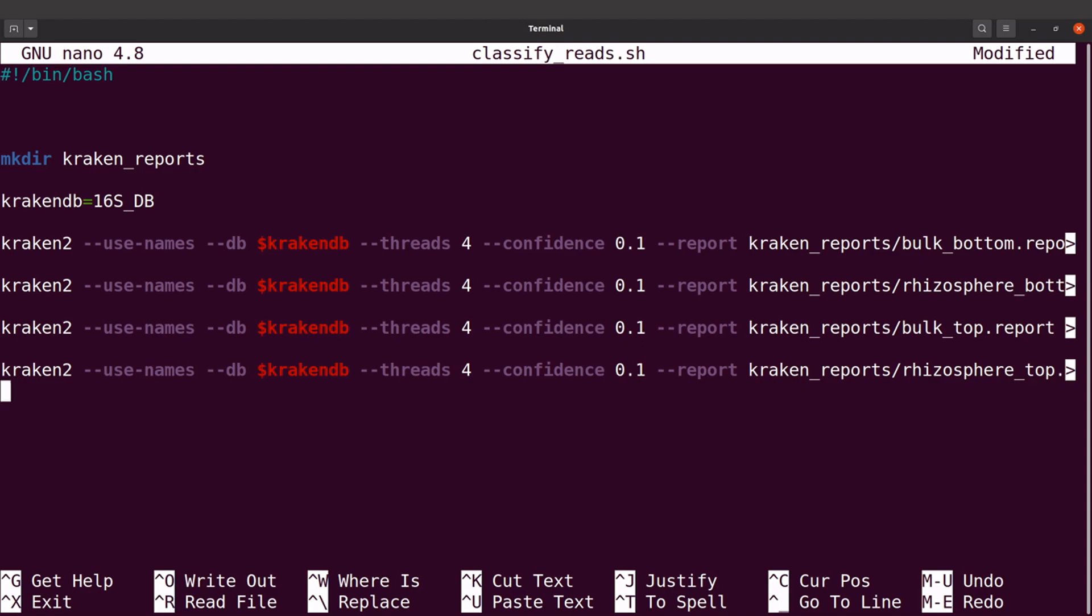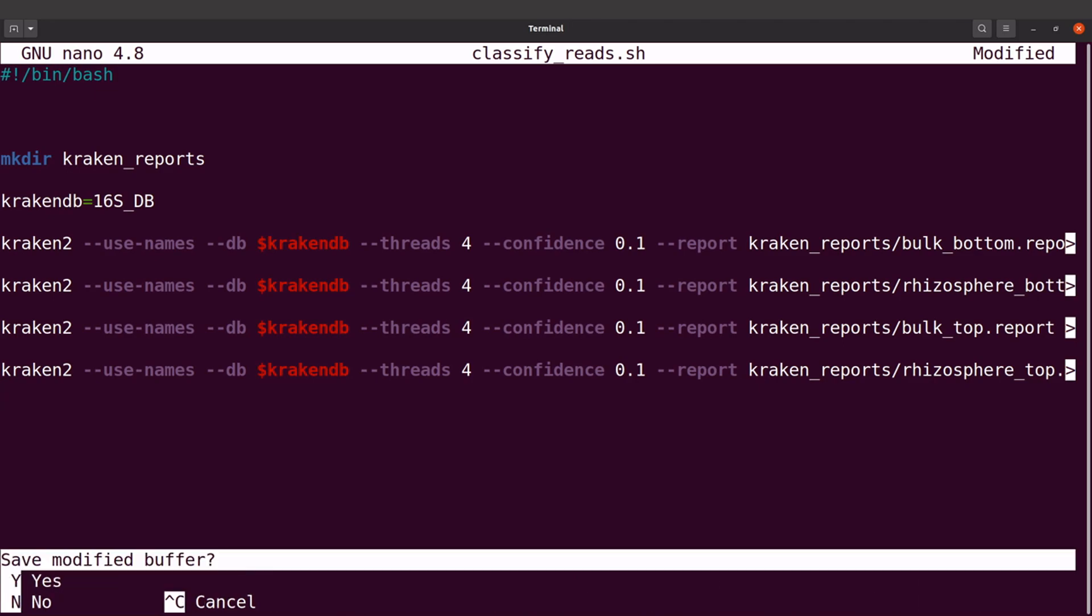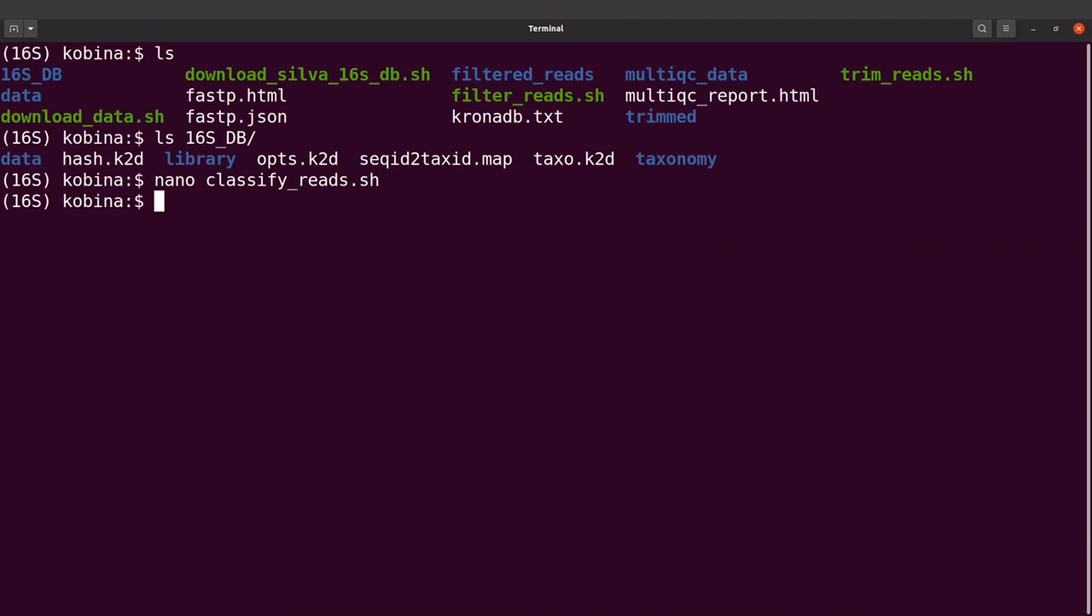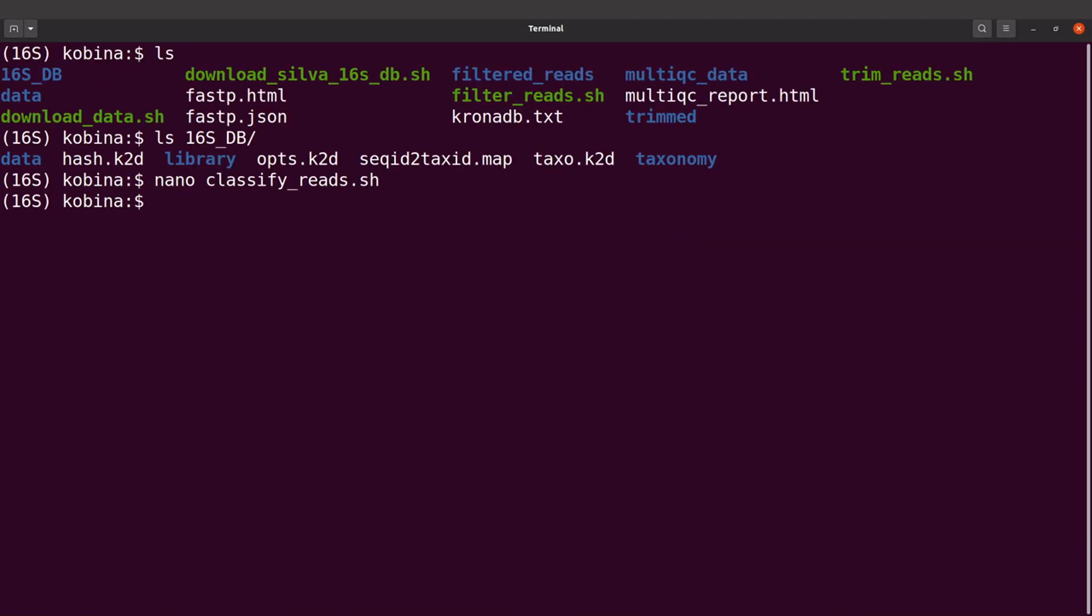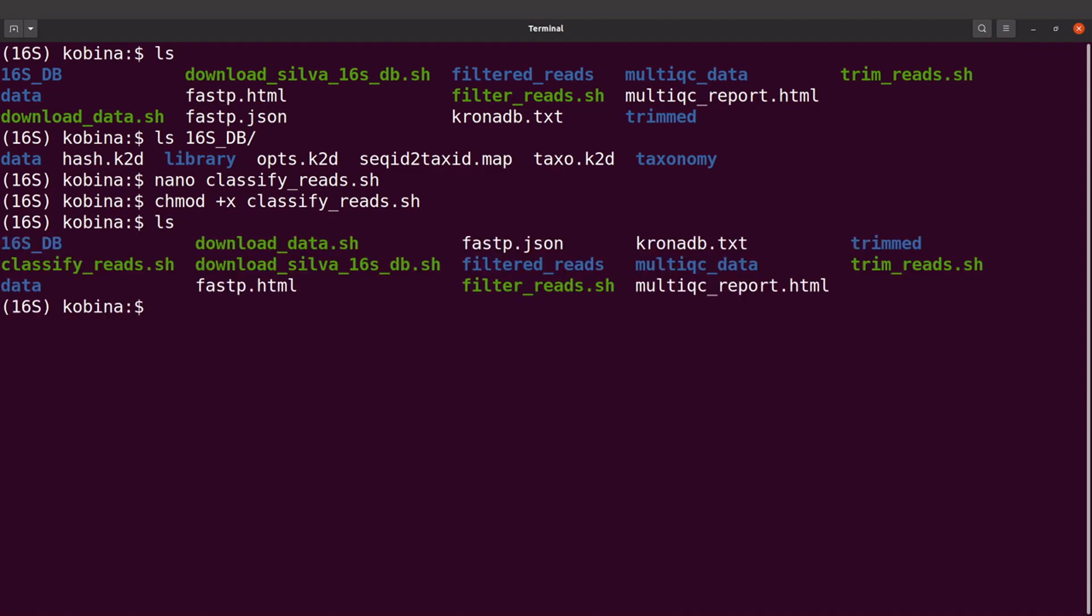I'll paste the commands here, exit and save changes. Then I will add execution rights. I'll say chmod +x classify_reads.sh. I will do an ls just to check the file, and that is here. I'm now going to execute the script.